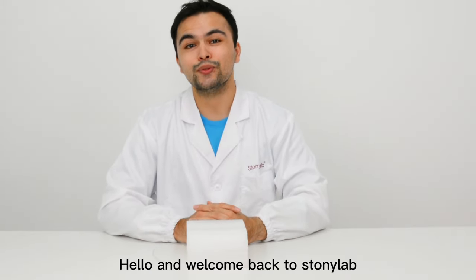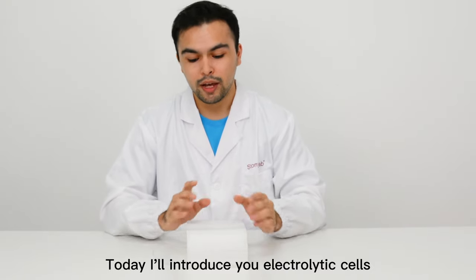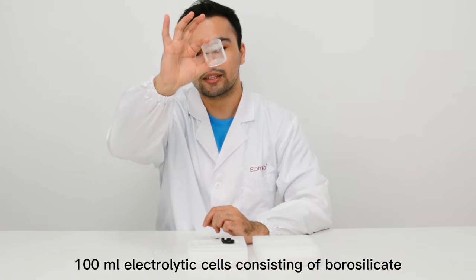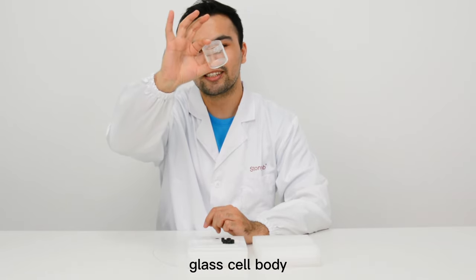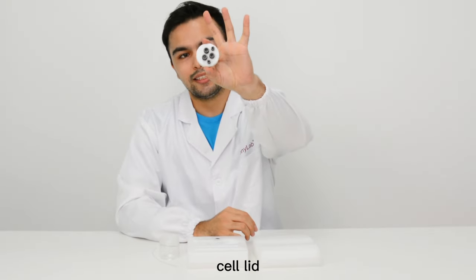Hello and welcome back to StonyLab. Today I'll introduce you to electrolytic cells. Here is a 100 milliliter electrolytic cell consisting of a borosilicate glass cell body and also the PTFE cell lid.